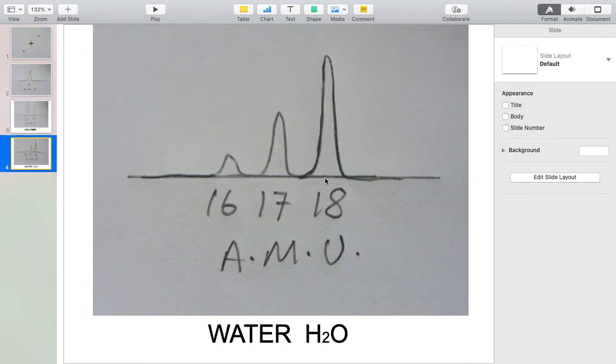But with a high resolution mass spectrometer, which are normal commercial things that are used for certain purposes, it's possible to get very high resolution and look down in great detail at exactly what the mass of these lines is. Well, this is known as the nominal mass, just the integer number, the number of neutrons and protons.